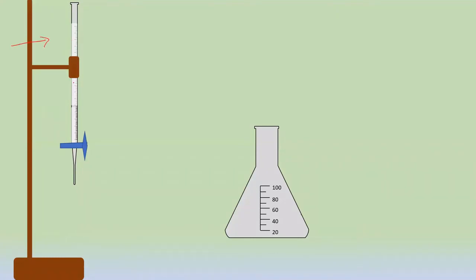We will keep the ethyl benzoate in the burette so that you can take exactly 1 ml of ethyl benzoate into your conical flask for the reaction. During regular practicals, you are going to take that 1 ml of ethyl benzoate in your conical flask. In the exam, it will already be given to you. Maybe 1 ml or some unknown amount will be given to you.